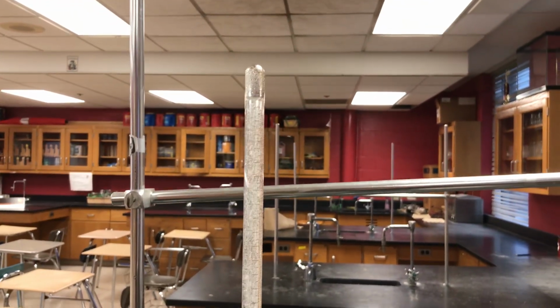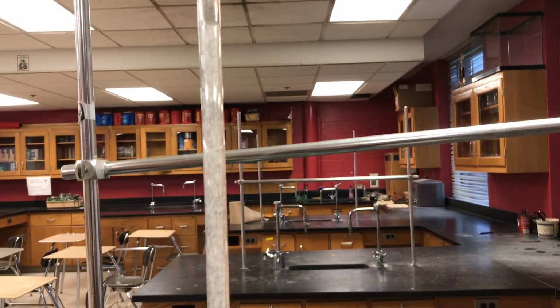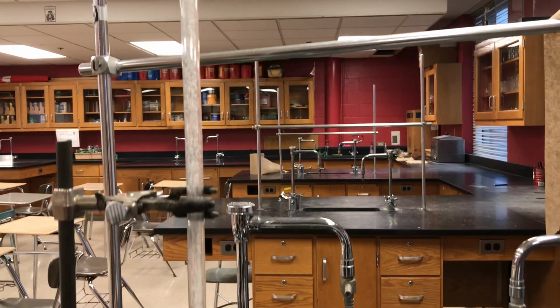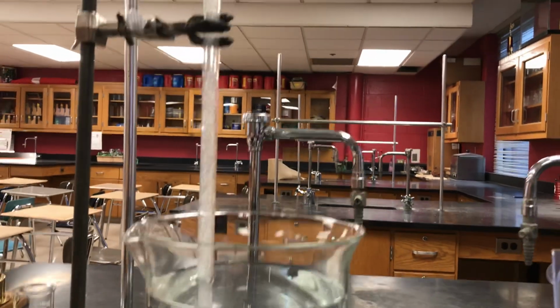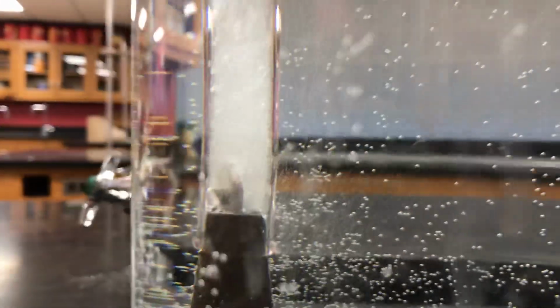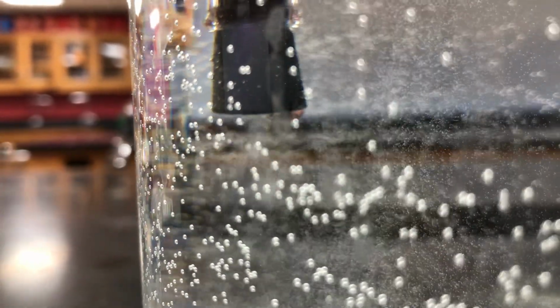Oh yeah, so the water's being displaced as the hydrogen is made. You could just see the effect of all that hydrogen being generated and sent up to the top. And if you look now, Mr. Moore, you can see the plume of fluid being forced out at the bottom, down below. That's the water that's being displaced out of the tube.